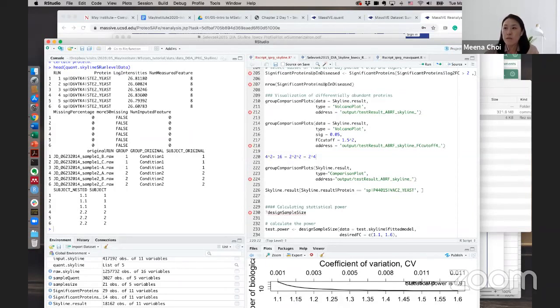We have a question about phosphoproteomics. For phosphoproteomics, you are more interested in the peptide level, right? So you want to do the analysis at the peptide level, and some people also want peptide-level conclusions, not protein-level. In that case, it's simple.